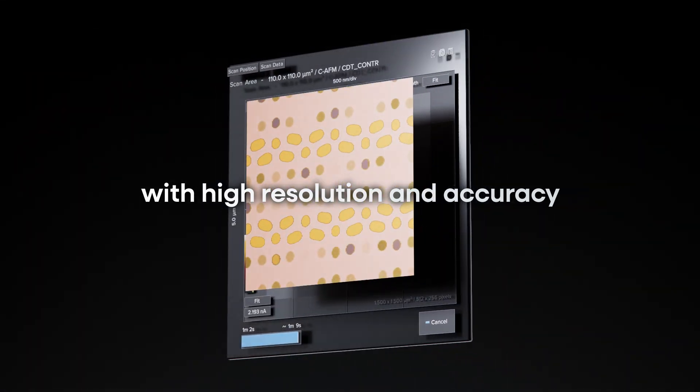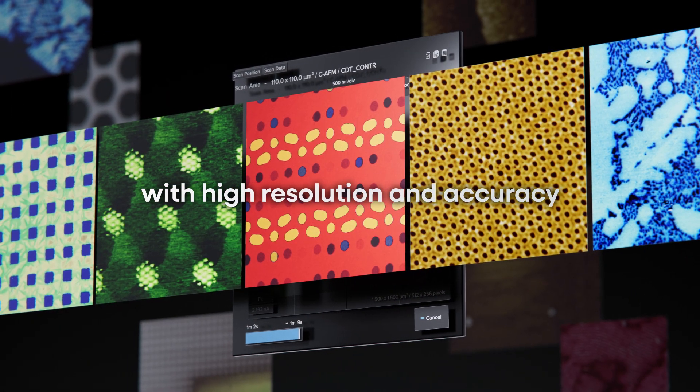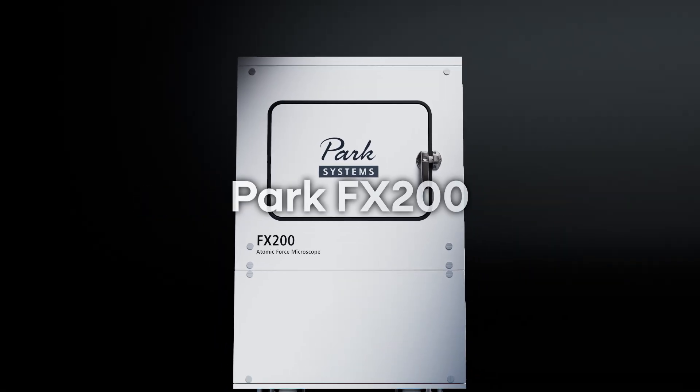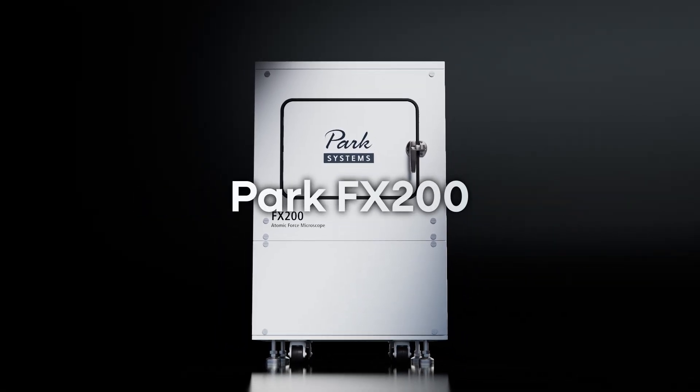With its wide versatility and superior performance, the PARC FX200 streamlines complex operations, making it ideal for both research and industrial metrology.